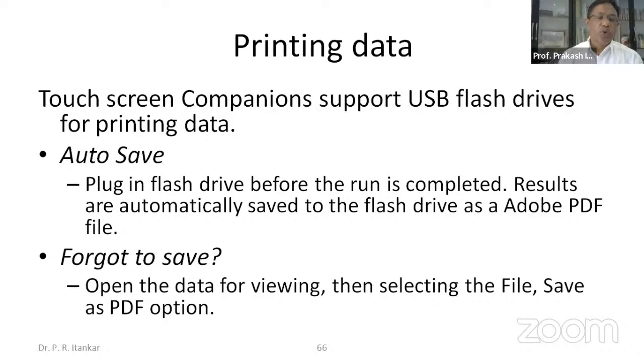So after moving from TLC to column, and then from column to the automatic flash system, is the desired separation of the compound achieved or not? Yes, usually 100% pure constituents are made available.